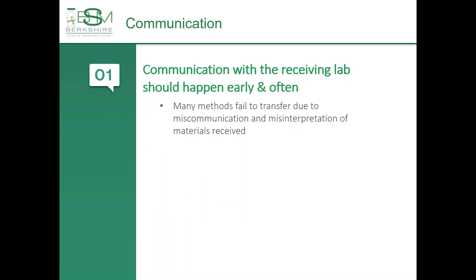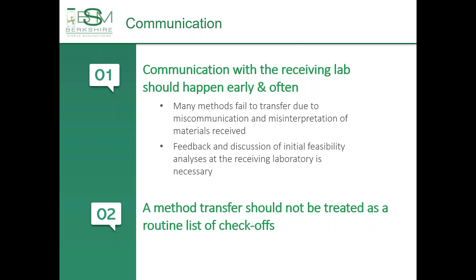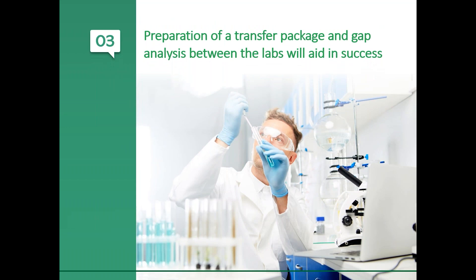Communication with the receiving lab should happen early and often. Many methods fail to transfer due to miscommunication and misinterpretation of the method instructions received — this is at the root of the most common issues. For example, a method may require the analyst to prepare a one ppm solution, but it is not defined as either gravimetric or volumetric solution preparation, which may cause differences in the receiving laboratory's results. Feedback and discussion of initial feasibility analyses at the receiving laboratory is necessary. A method transfer should not be treated as a routine list of checkoffs. By trying to use a one-size-fits-all approach, critical details may be missed. Preparation of a transfer package from the transferring lab and a gap analysis between the labs will aid in the success of the method transfer.